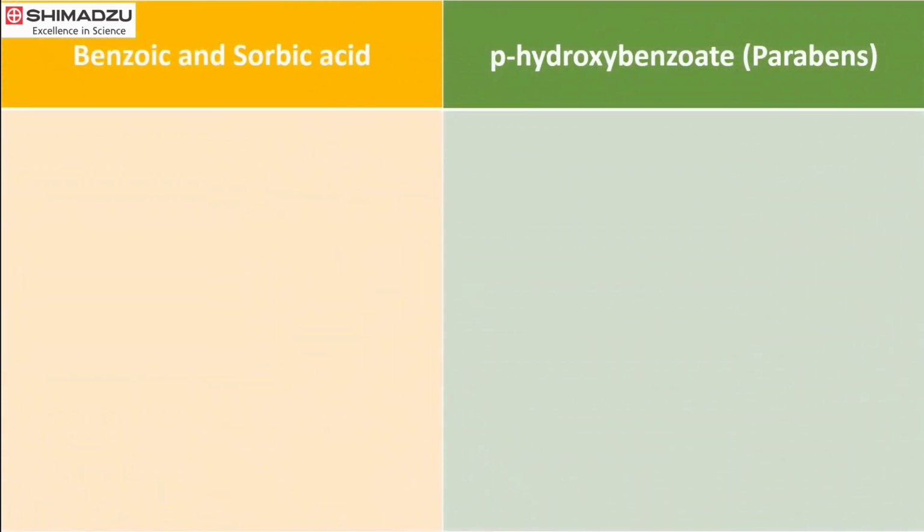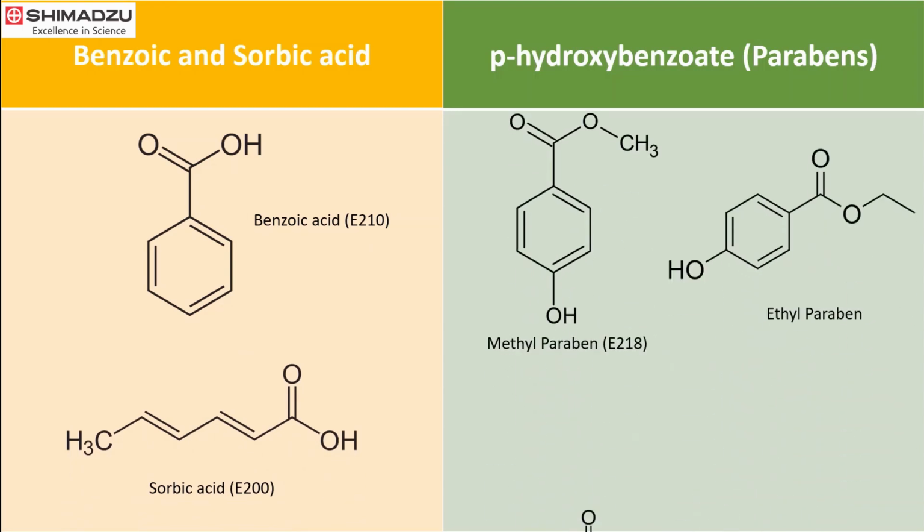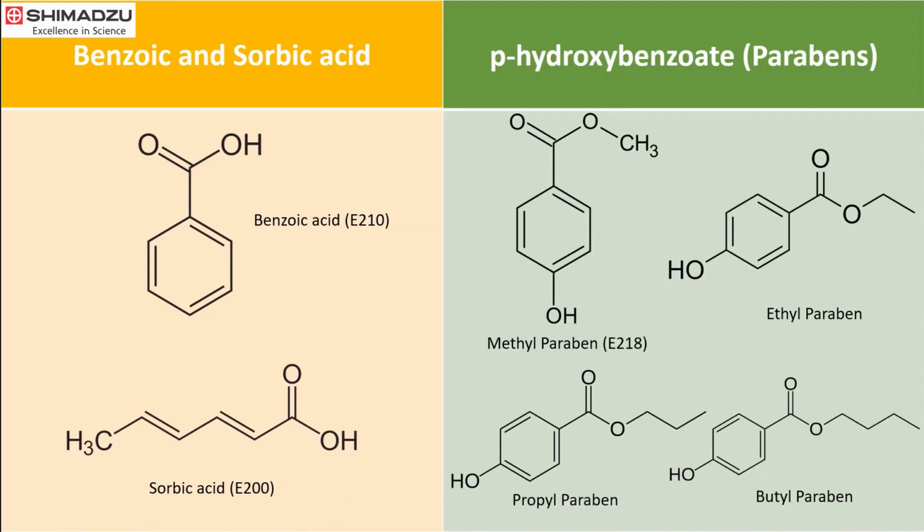As such, the analytical determination of preservatives is important. The target preservatives in this analysis are benzoic acid, sorbic acid, and 4 parabens, which are methyl, ethyl, propyl, and butyl parabens.